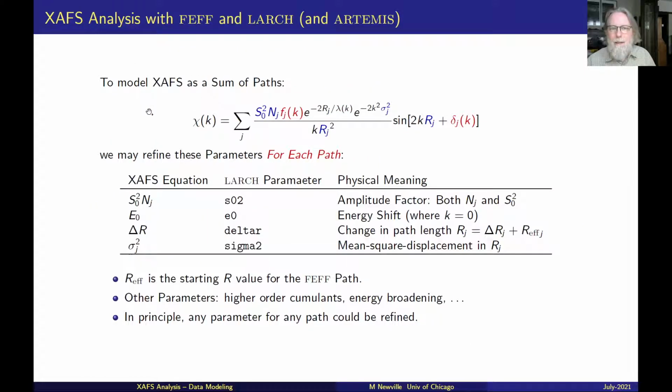To model the XAFS, then, we'll parameterize this XAFS function. This will be the model that we use to model data. And in the XAFS equation, we have these terms, and those are turned into fitting parameters, or path parameters, as we call them, in Larch and other analysis programs. And here are the physical meanings for those.